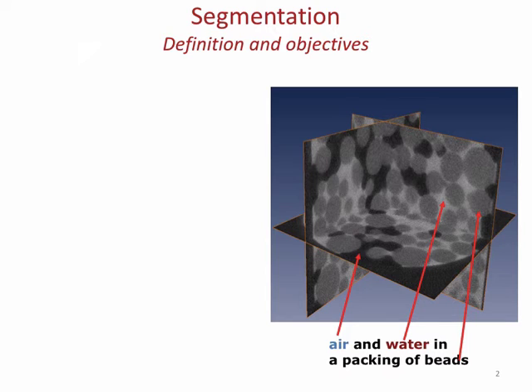So here I would like to separate air, water, and glass beads. And it looks like a reasonably easy thing to do in this image. If I actually pile together a histogram, I should be able to draw a line between different phases and see them separated. Well, this simple thresholding is the basic and very cheap segmentation method.